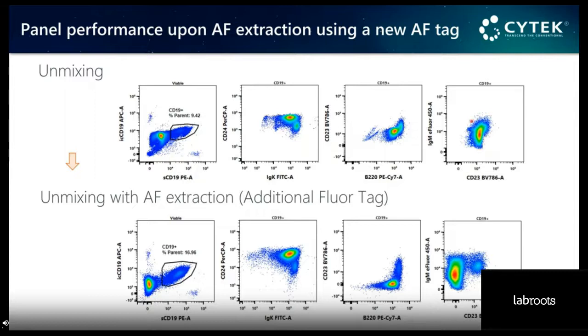That autofluorescence was still there. The background was masking these positive signals. And now doing extraction clearly reveals the true fluorescence of these dimly expressed markers. The benefits of autofluorescence across multiple samples are really clear, giving you in general better resolution for your data. And on this particular part, the critical point is that you can define, if your sample is very heterogeneous, you can define multiple tags to characterize the different subsets in there out of your unstained sample and do the correction to get better resolution.